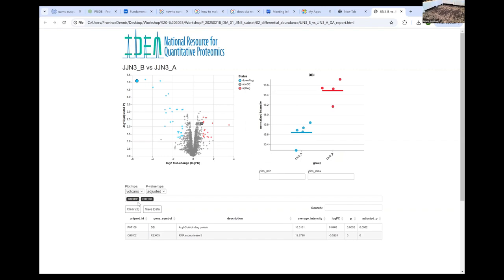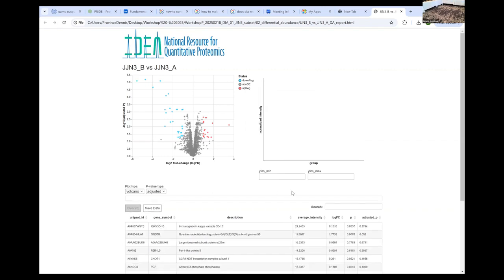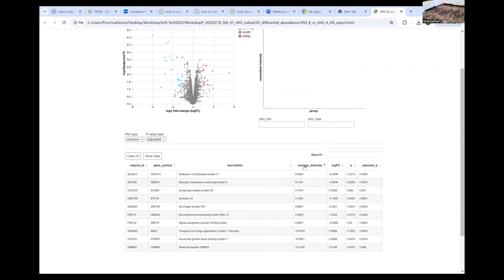So the other thing that we can do is, again, you can sort it by intensity. You can look at all the high intensity guys first. Of course, actin's the top of the list. That's really exciting. Everybody wants to do studies on actin these days. Histone H4 is always a really abundant guy. And then you could also look at which ones have the greatest log fold changes and adjusted p-values.